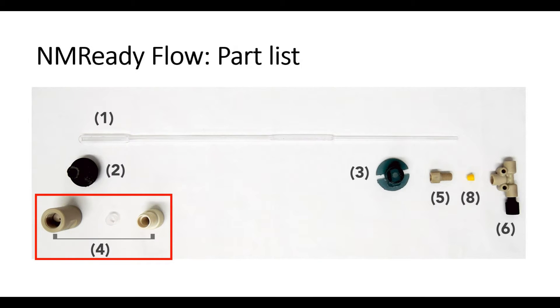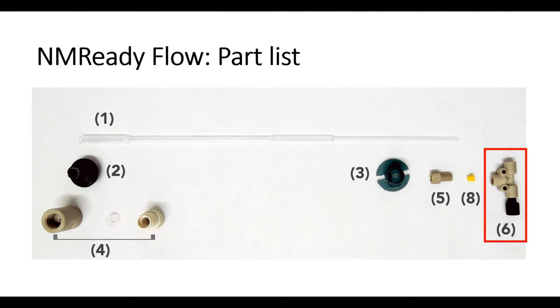Also included is a reducing union for connecting the top of the flow cell to chromatography tubing, a flat headed nut, a 90 degree connector to connect the bottom of the flow cell to chromatography tubing, and the appropriate ferrules.